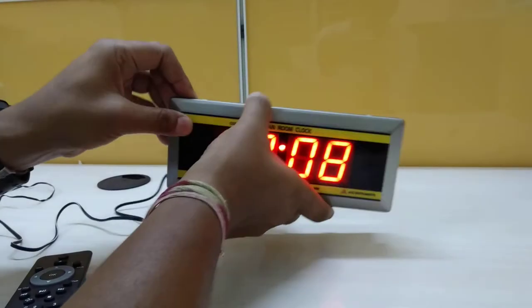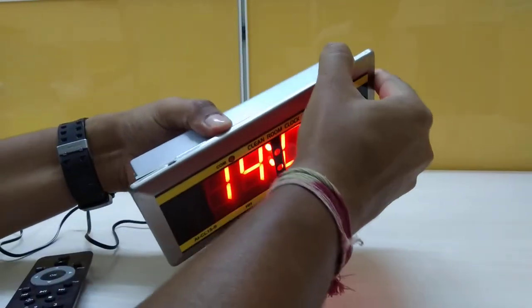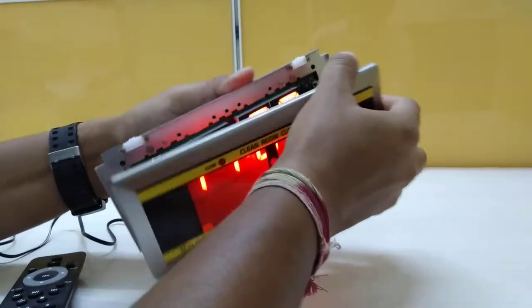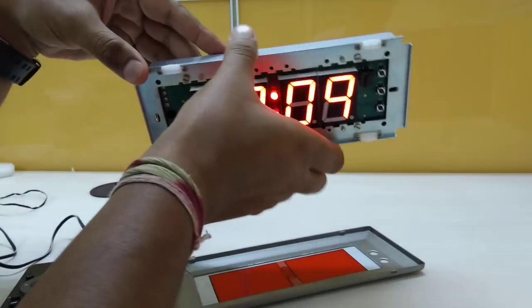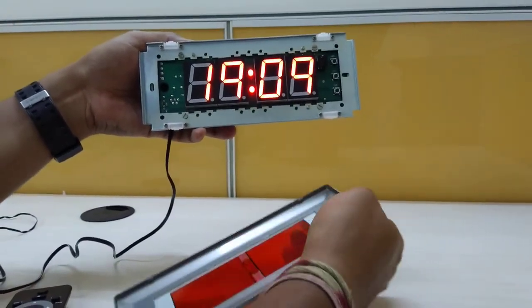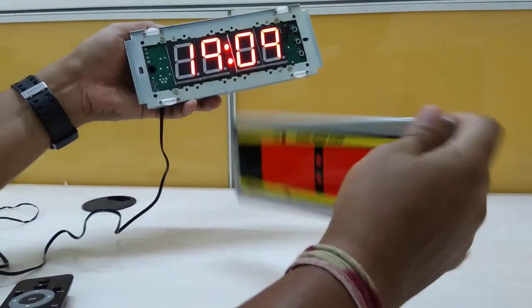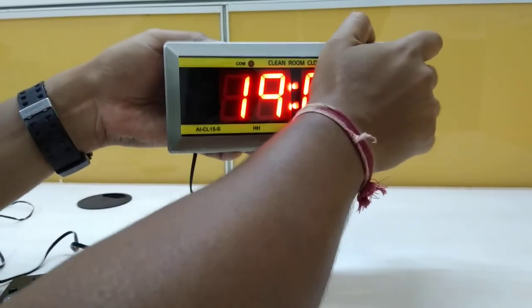If you want to see how it gets into the panel, it's something like this. You need to just put it into the modular wall, insert it, and then you have to put this front panel onto the clock.